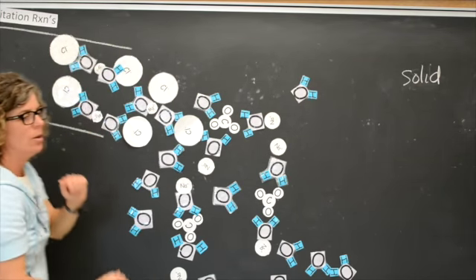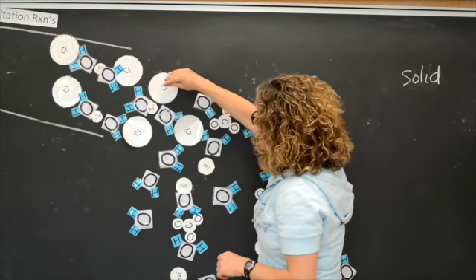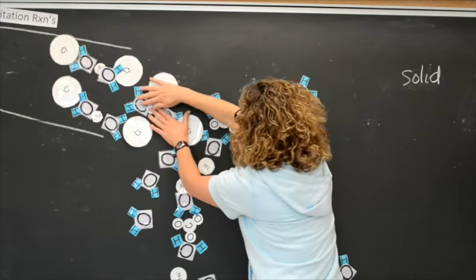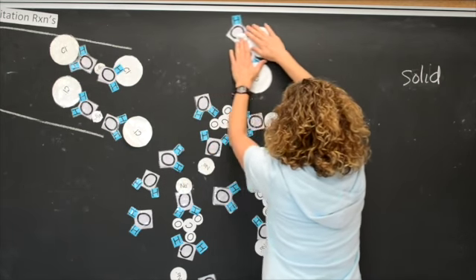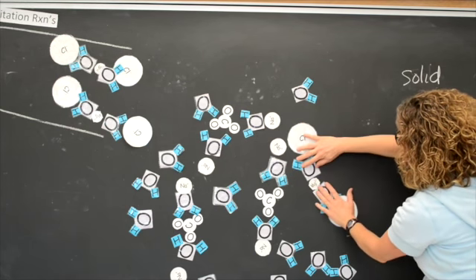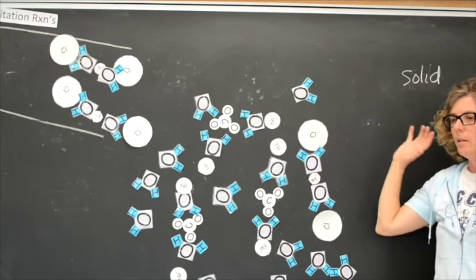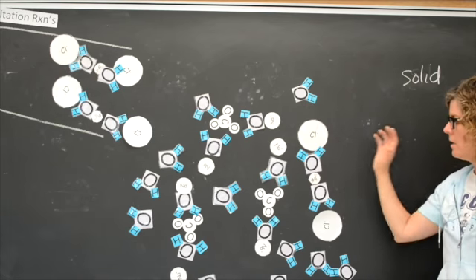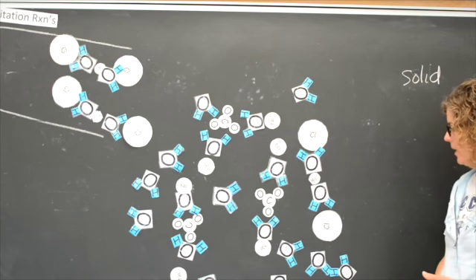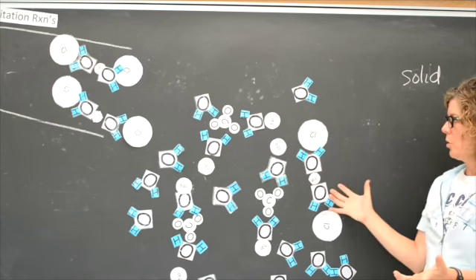Okay, and I'm going to go to the other side here. I'm going to take one of these magnesium chlorides and take it over to here so I can show you on this side. Okay, it has dissolved. The fact is that when these two substances come together, we are going to form a precipitate. So let's try and guess what that precipitate would be just from your knowledge.